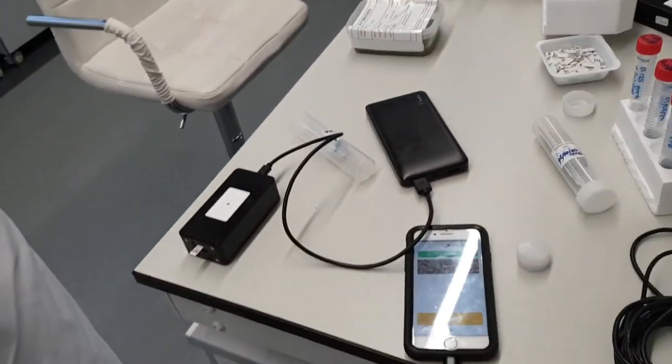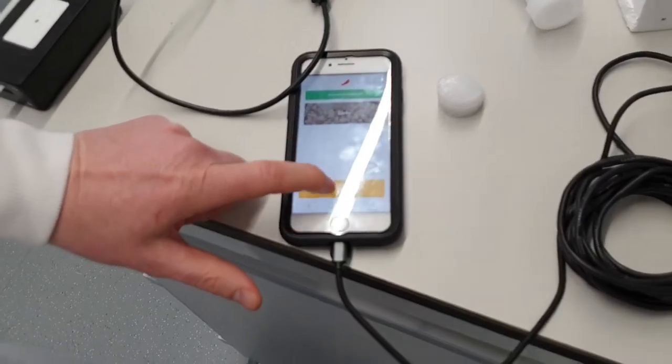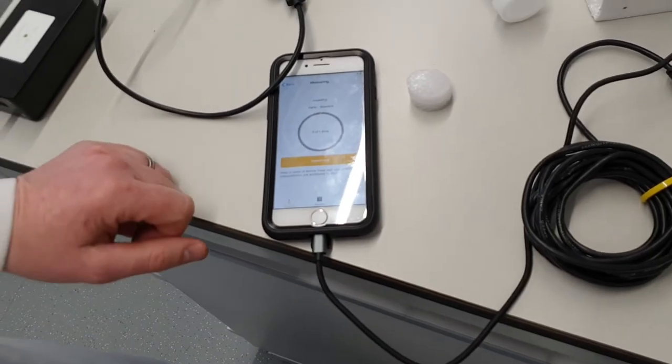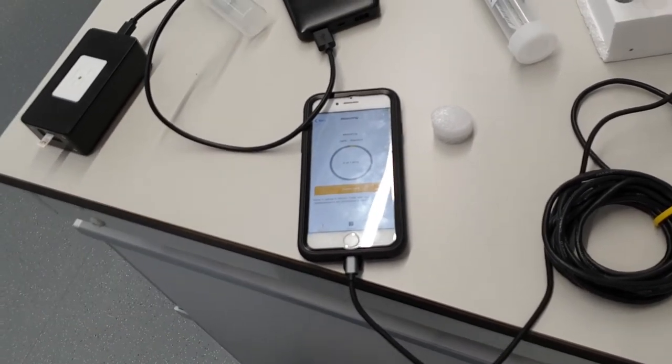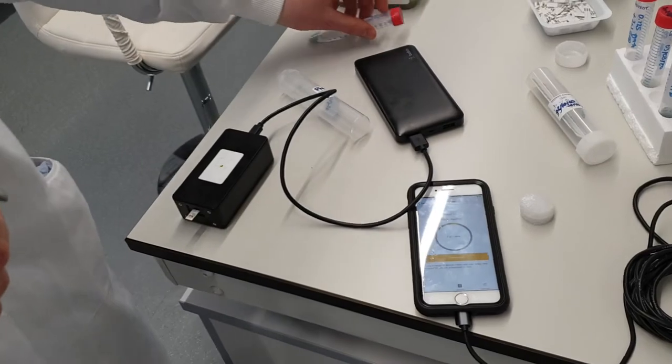Now we'll do the measurement itself. Simple enough. It's loading the method. It's now running the method. So this takes about 60 seconds.